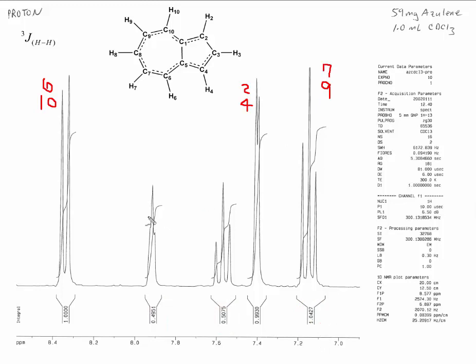And we're left now with just these two triplets down here. And hopefully now, from using the magnitude of J argument, you'd be able to identify that the triplet that's more well-formed, that's wider split here, would be associated with the 7-membered ring. And so this would be 8. This is the 8. And then this would be the 3, the triplet associated with the smaller ring. There's our assignments. Look back at them. See if you agree with how we came up with that.